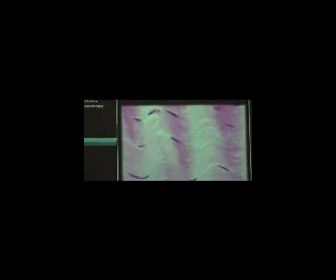Loose or dense? Dense. Regular, irregular? Regular. Those purple dots are fibroblasts. Non-living matrix? Collagen. Dense regular. So the non-living matrix is collagen. And in dense regular, remember, there's no elastin there. It's entirely collagen.